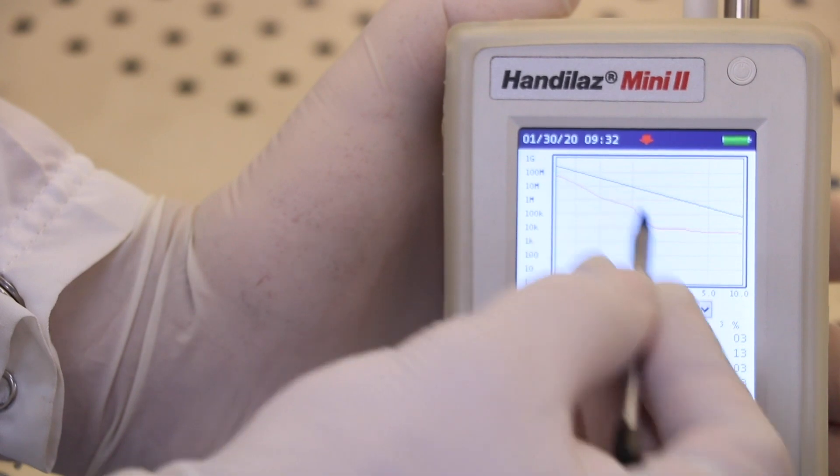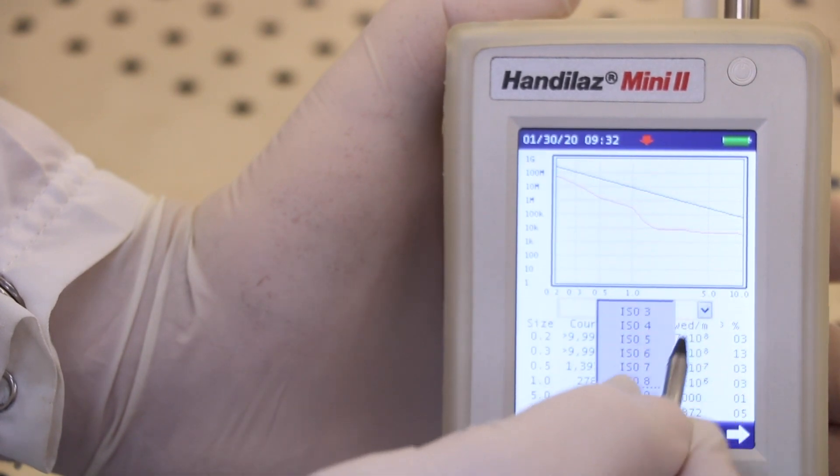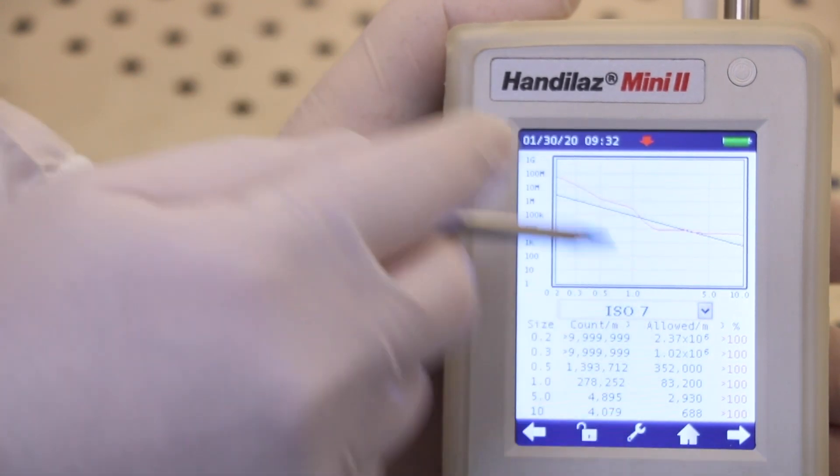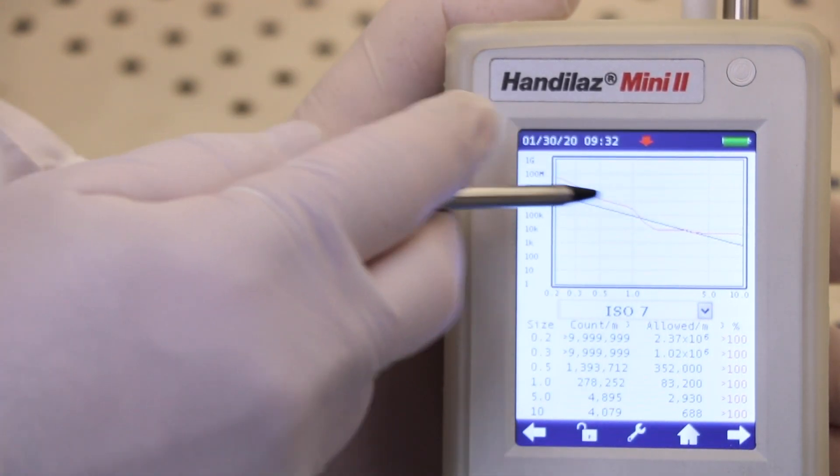But do we meet a cleaner spec? Let's see. We'll use the same data and select ISO class 7. Now the red line is largely above the threshold limit, and all the percentages relative to the particle size exceed the limit.